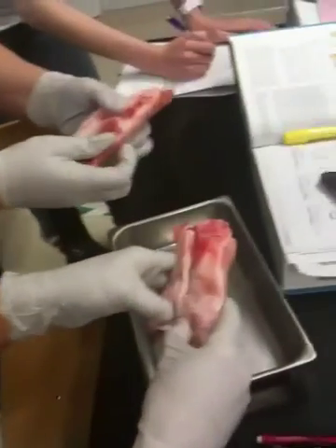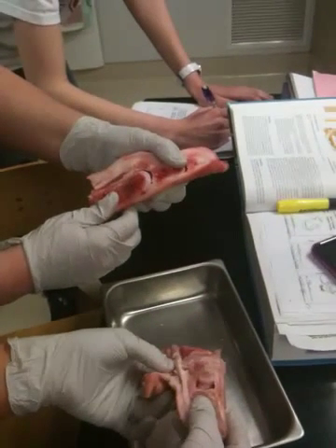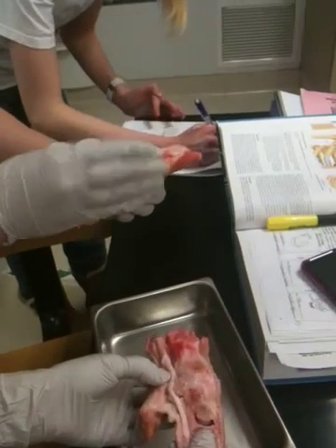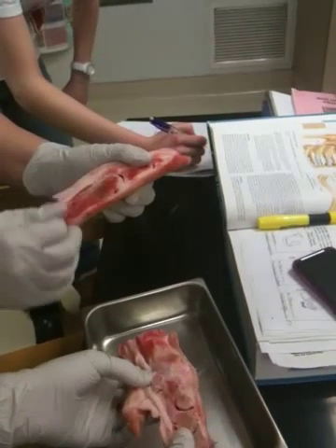The articular cartilage is the shiny white stuff on the ends of the bone. The synovial cavity is the actual space, and the articular capsule creates the synovial cavity that holds the synovial fluid.